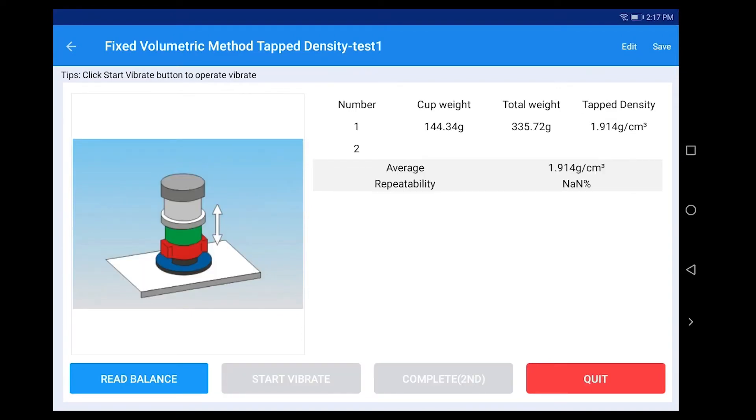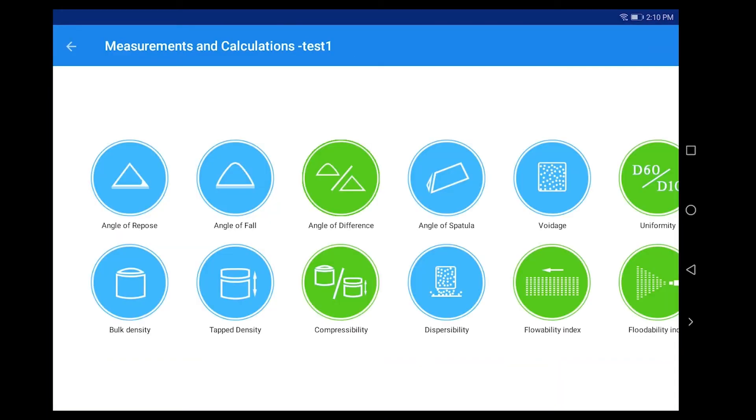Click Complete first, click Save, and click Quit to complete the tap density measurement fixed volumetric method. It is recommended to repeat the test three times to calculate the average value.